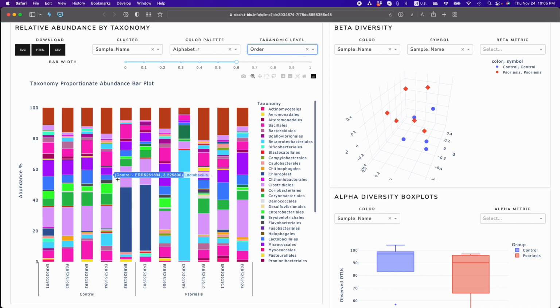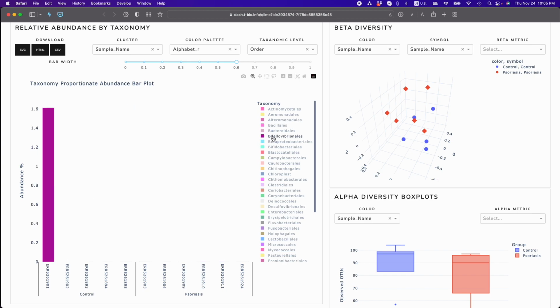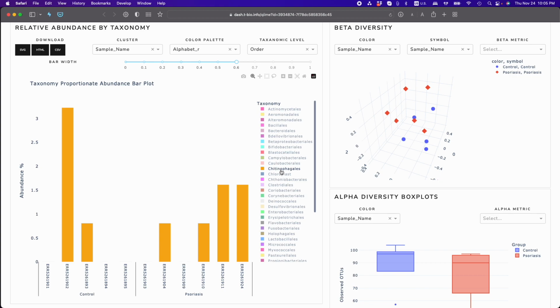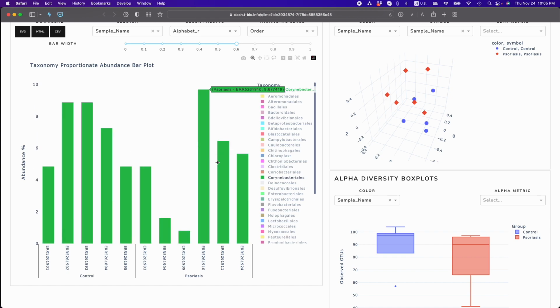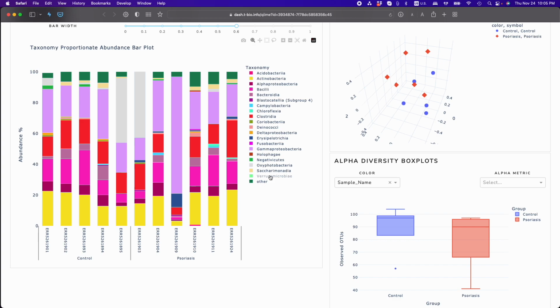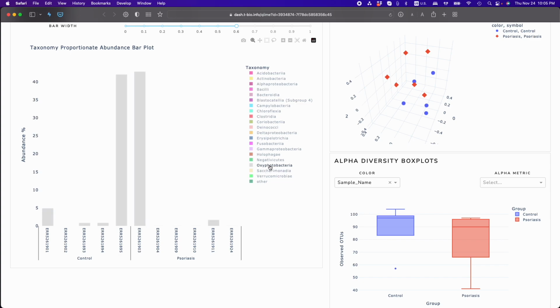Here again, visually, it might be a little bit confusing. So we might want to take a look at some of these examples. Maybe, for example, this one is only present in controls. Okay, and so just by exploring our data, we can start identifying some trends. And these trends could be very useful because we can start asking specific questions about these types of bacteria, and we can also manually find some of them that are very interesting.